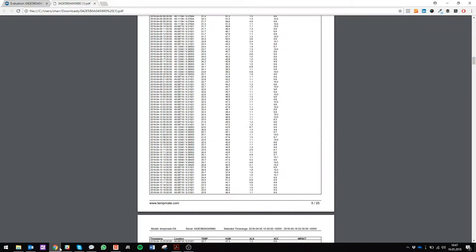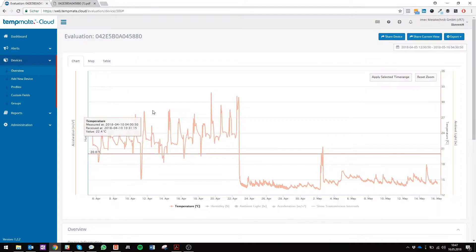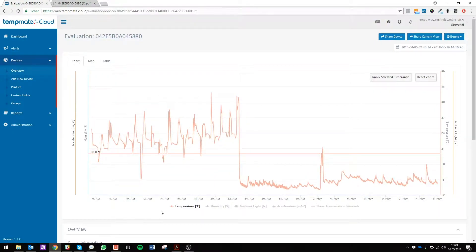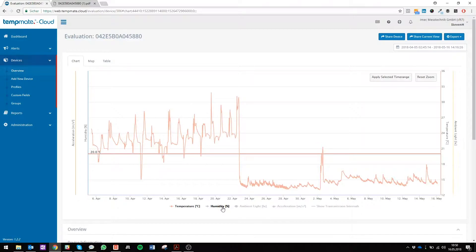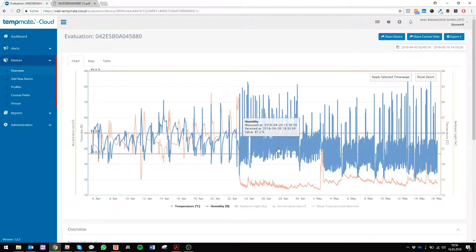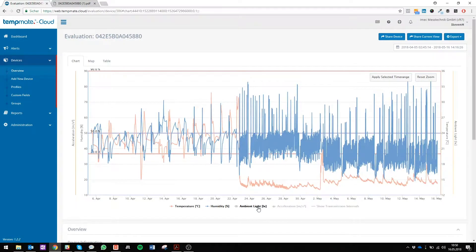Now we go back to our chart view. Here in the chart view you can see all the necessary data that has been recorded over the period of time. You can choose between temperature that is actually activated right now, then you can activate humidity that has been shown in blue.